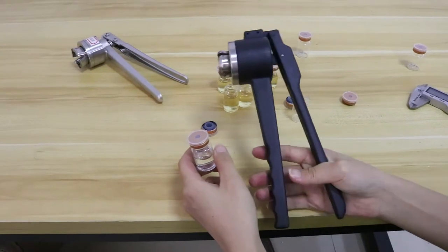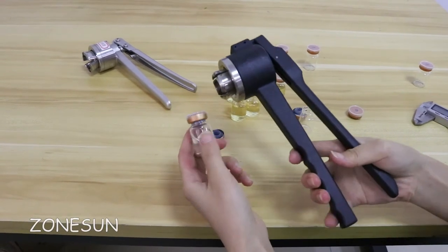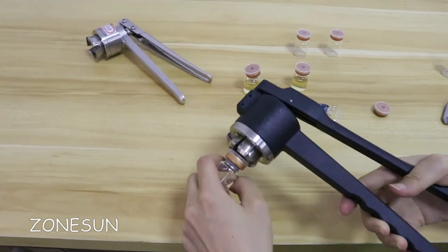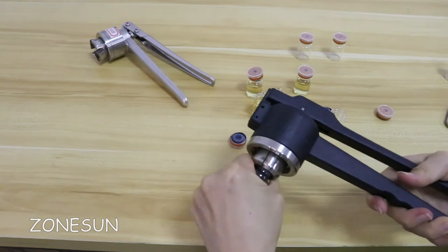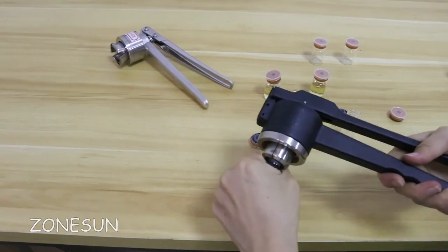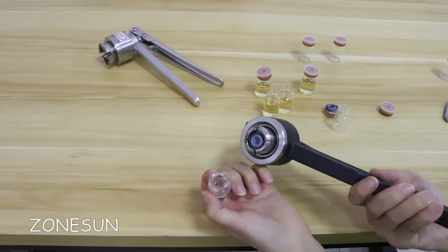This manual tool can also be used to open the wild cap. Now I will show you how to open this cap. Now it is open — very easy.